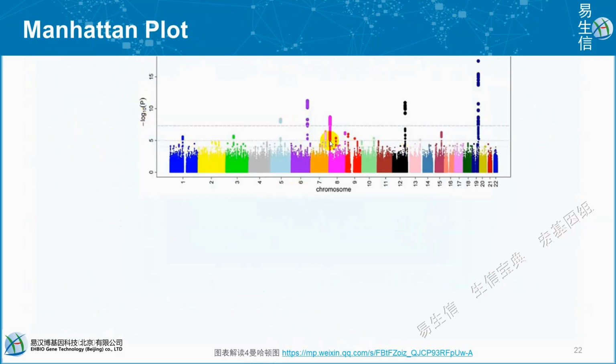Now the Manhattan plot is this. You can draw a Manhattan plot the same way we described for the volcano plot and the heat map: you can use it under command line mode, you can use it under RStudio, and you can use the online link as well.